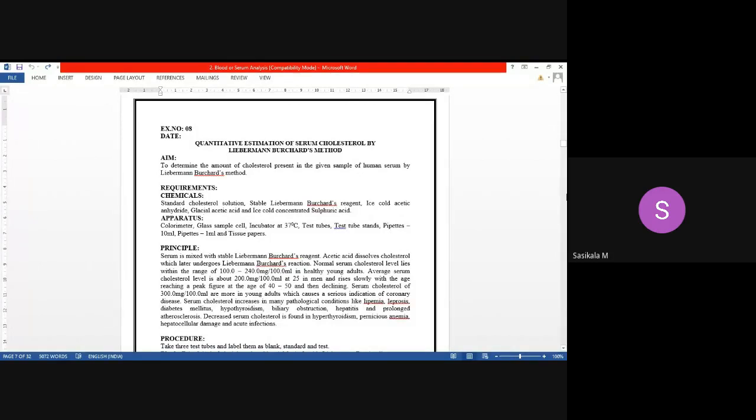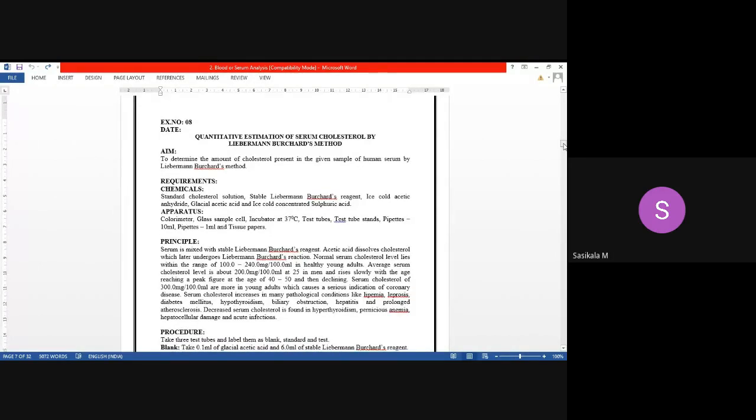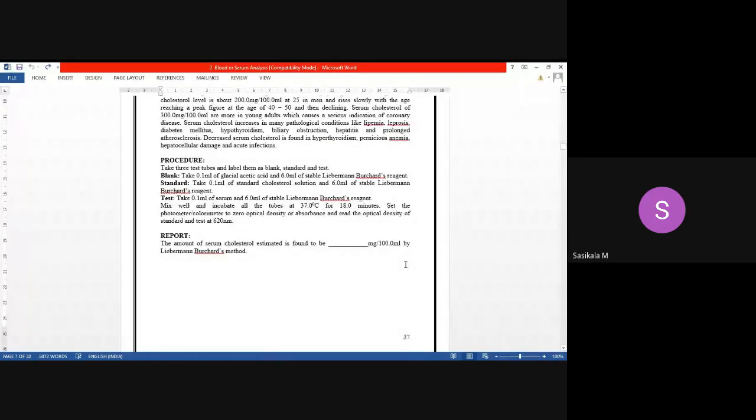Okay. Next, we'll move on to the procedure. I'll be giving you how the reaction takes place between Liebermann-Burchard's reagent and your sample. Now let's discuss the procedure.